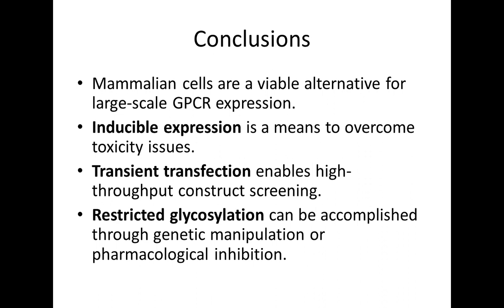I will say that with working at things in the liter scale, you shouldn't be having to do gigapreps at a time. Lots of times a simple maxi prep will see us through all of our needs for a particular construct for a run or two.